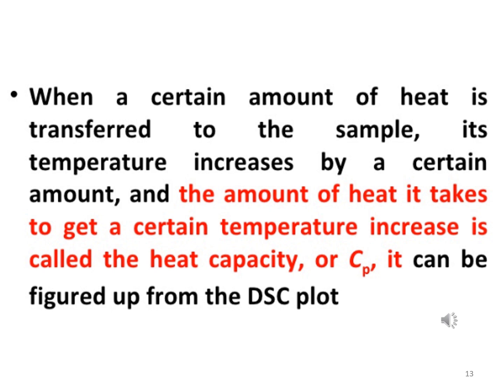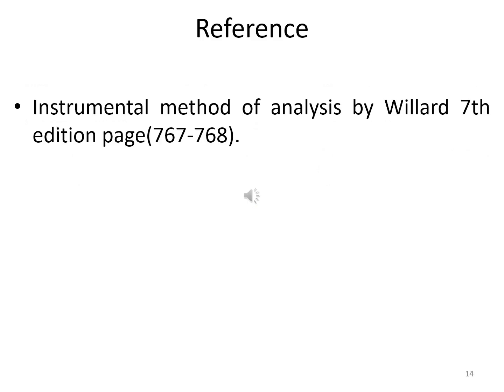In the next lecture we will discuss the DSC plot or DSC curves, and also DSC calibration and the information that we can get from the DSC curve or plot. For further information, you can consult this book, and you can also find some other sources online.